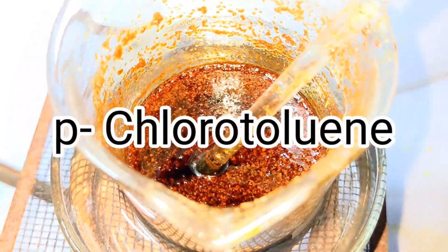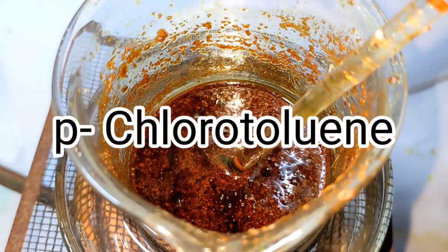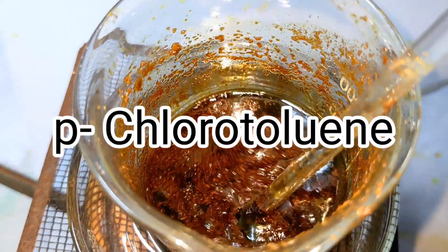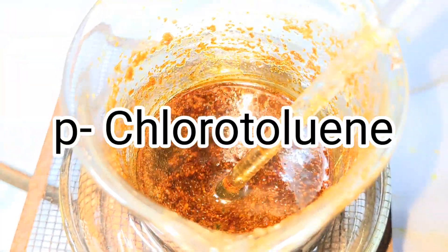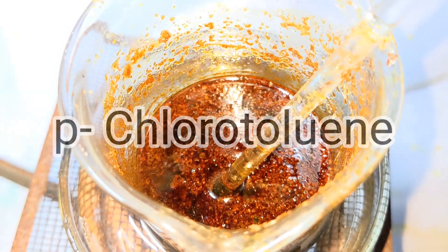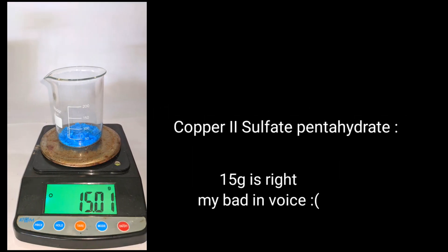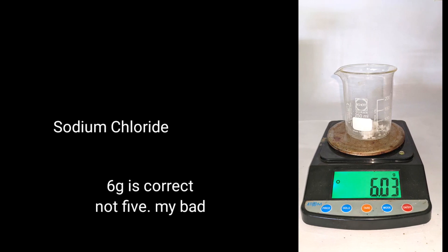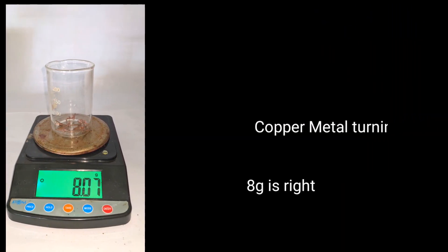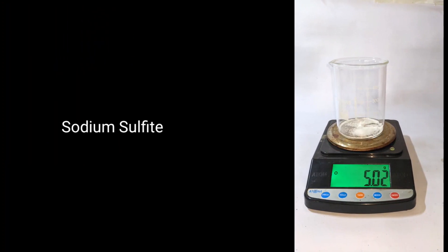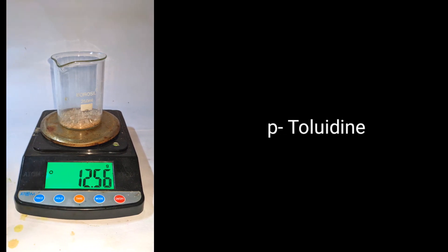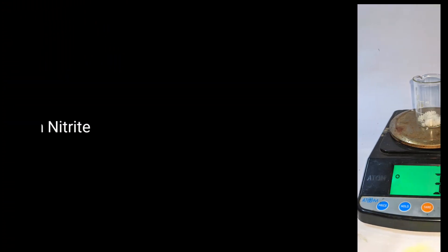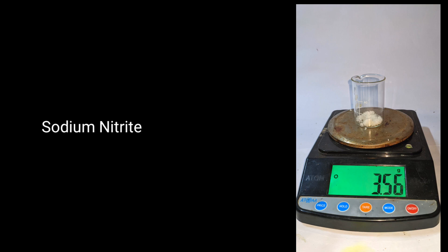Hello friends. In this video, we will be making the compound parachlorotoluene. For this experiment, we will need 10 grams of copper sulfate pentahydrate, 5 grams of sodium chloride, 10 grams of copper metal, 5 grams of sodium sulfite, 12.5 grams of paratoluidine, and 3.5 grams of sodium nitrite.